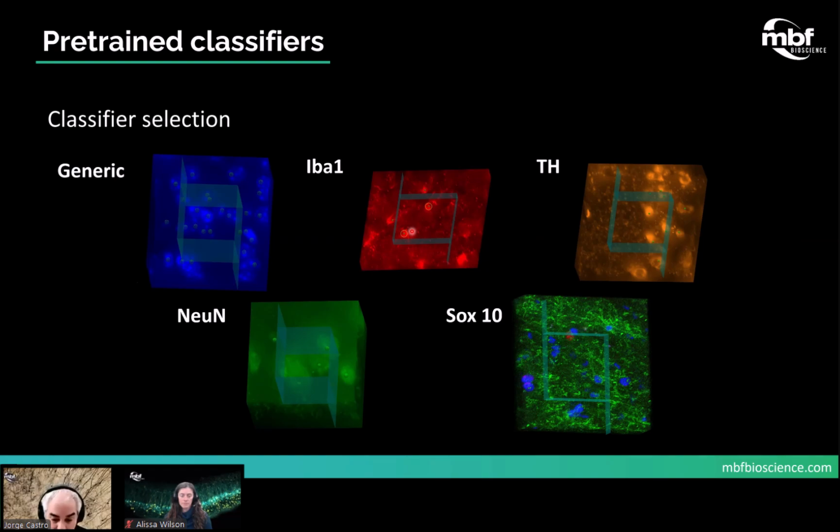So if you don't see a cell type you would like to quantify, let us know and we'll try to create one for you. Right now, all new classifiers are trained in-house, but with end user feedback, of course. The reason we are training the classifiers in-house is that at this point, it's easier to provide better results by getting feedback from the end user and incorporating that into the classifier by one of our expert developers than really the end user dealing with refining the classifier by themselves.